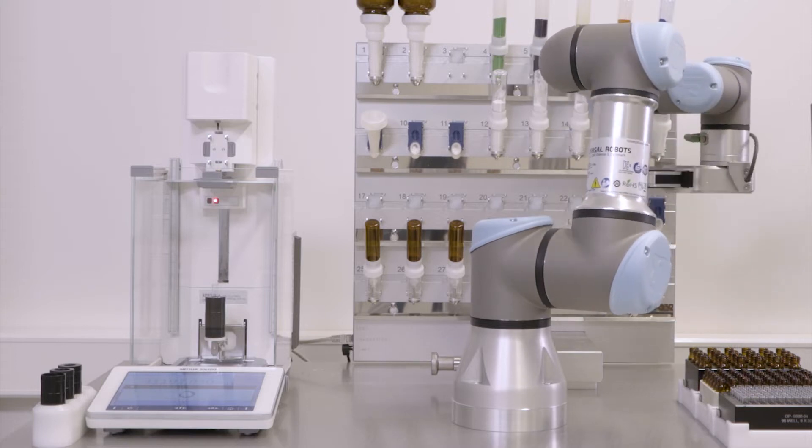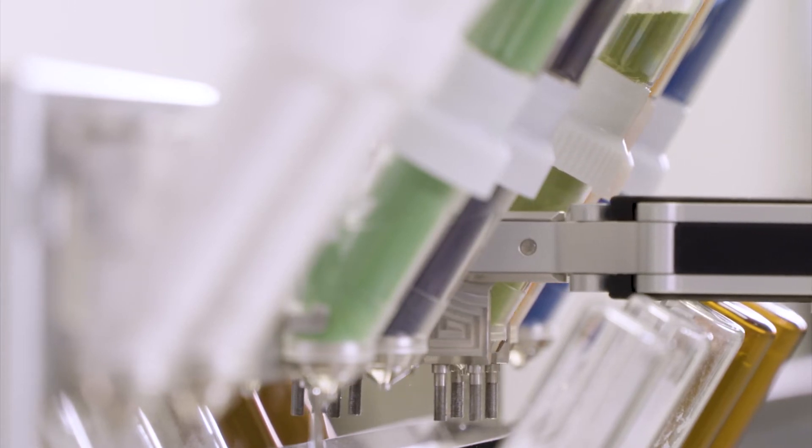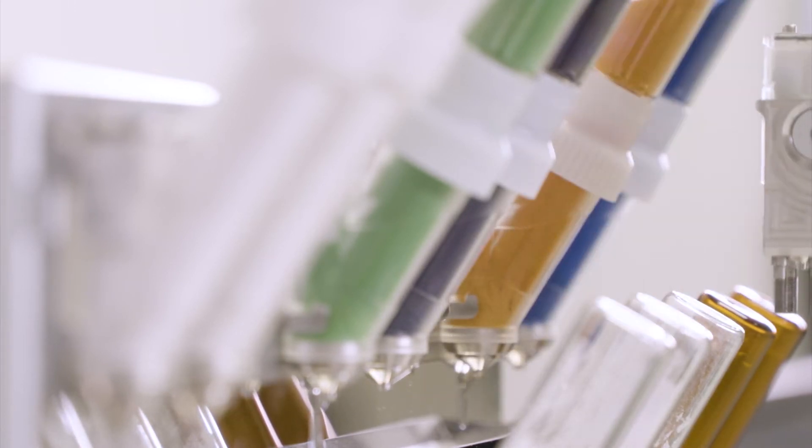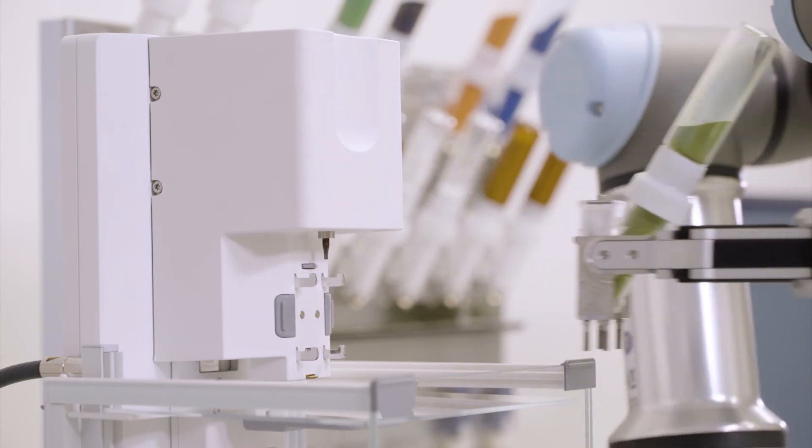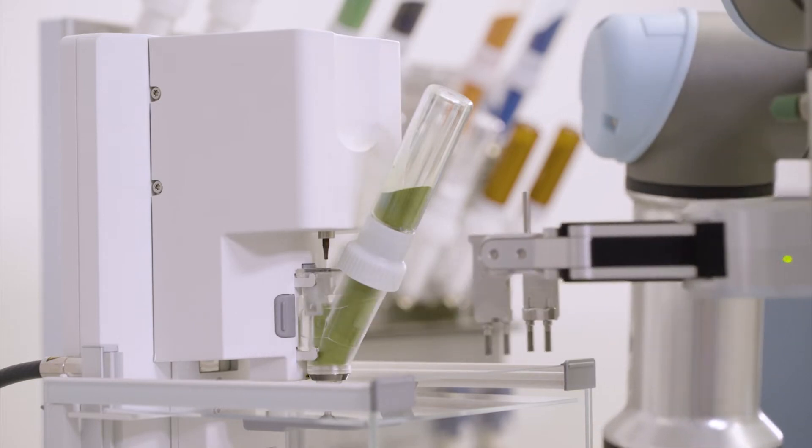All required chemicals, filled in separate dosing heads, are ready and waiting on the platform. The substances in the dosing heads are identified with RFID. The robot takes the appropriate dosing head and places it in the dispensing module of the balance.